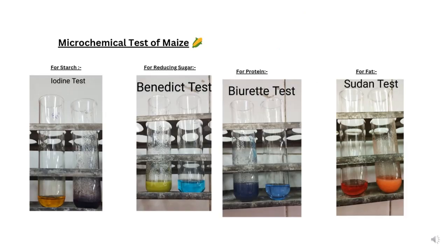And these are some more pictures to show the iodine test for starch, reducing sugar test, Benedict's test, biuret test for proteins, and Sudan test for fat.